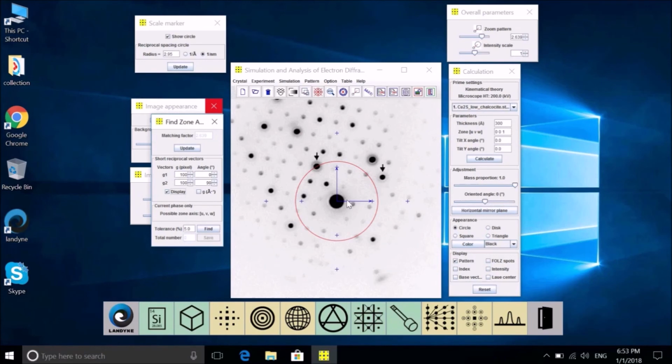Here there will automatically be 2 vectors, but we need to point out the nearest ones, like this one and this one, for us to find out. Now first the angle to this line, and we need to shrink the pattern. You can fill in a certain value directly here, and this is 88. You can fill in 44. Click here again and make it smaller. Not necessarily fixed, but you have all this line of markers, so fit to that line approximately. So increase. Try your best to fit in.